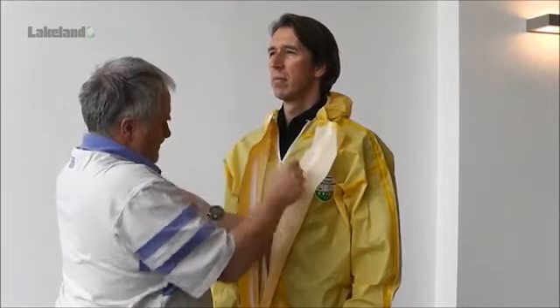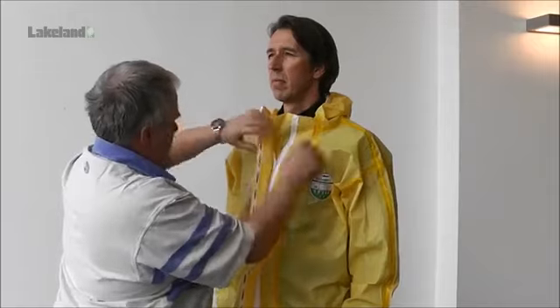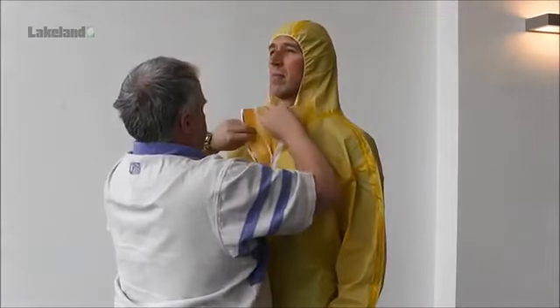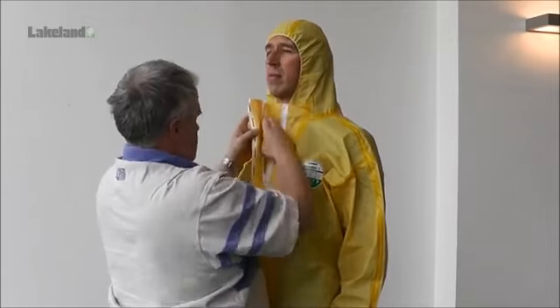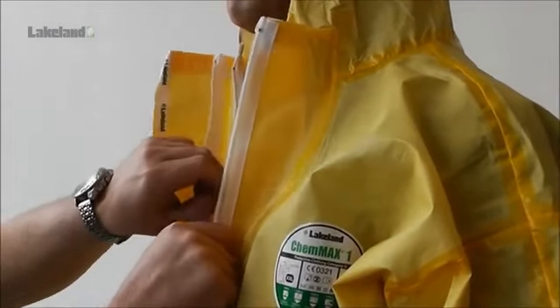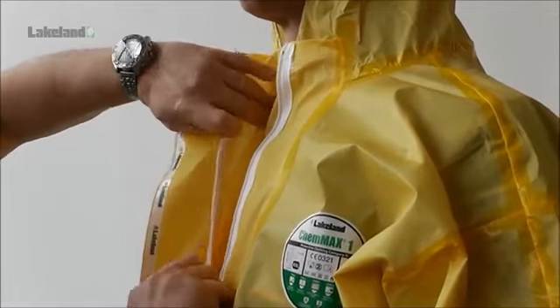From this point, you should have a colleague assist as they can ensure all closures are fastened correctly. The flap inside the outer zip should be folded back on itself and the outer zip can then be pulled up. Leave the last few inches until the hood is in position. Take care not to catch any fabric in the zips. The hood can now be carefully pulled over the head and adjusted for comfort. Once the hood is correctly positioned, the last few inches of the inner zip and then the outer zip can be fastened fully. After closing the inner zip, the inner flap should be folded back on itself before closing the outer zip.